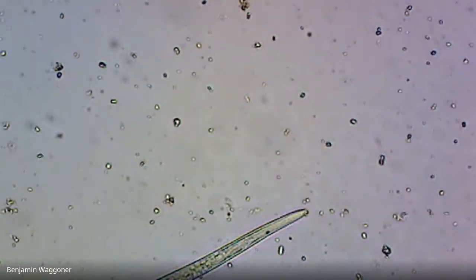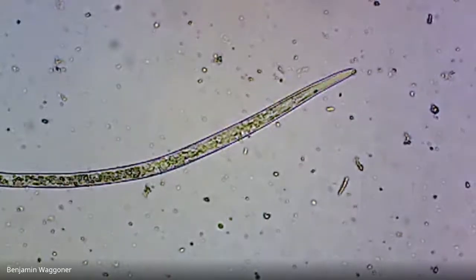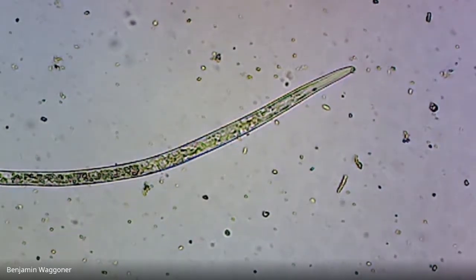Oh, we've got ciliates anyway. Yeah, no way I'm getting a fix on that one, but that's a ciliate. That's a nematode, one that's not looking too happy about life, or quite possibly the lack thereof. But yeah, there's that nematode, and there's the head end, and I'll let you decide what it's got for mouth parts.